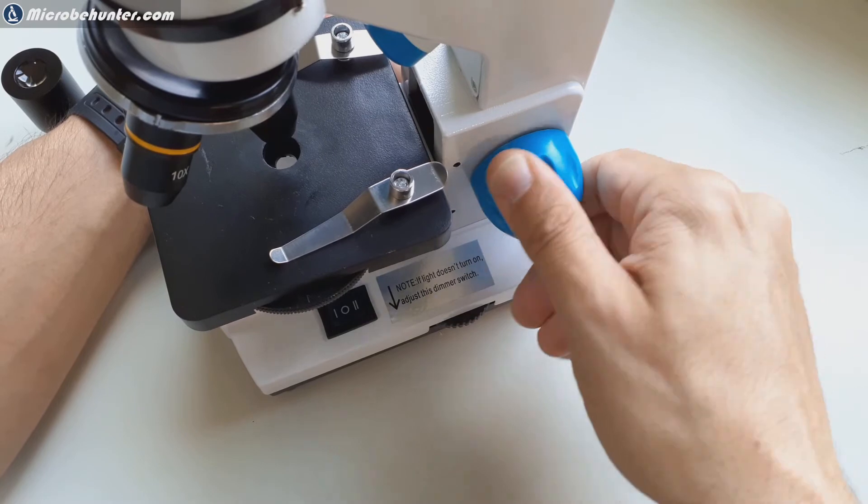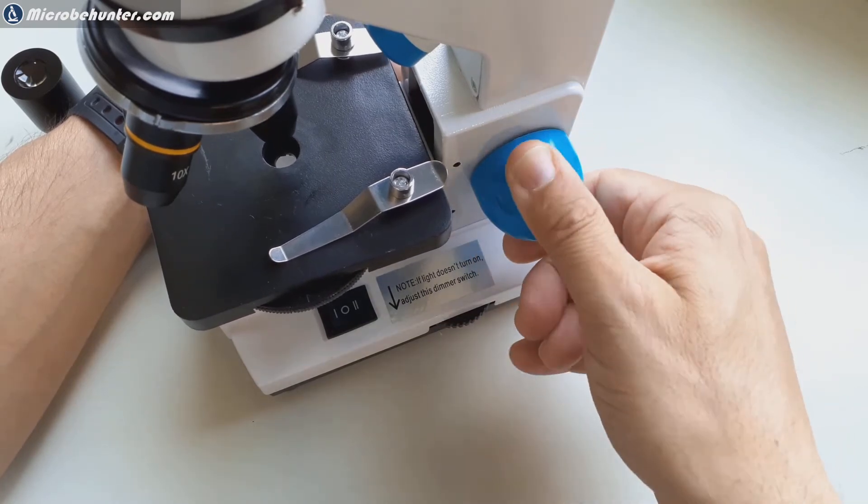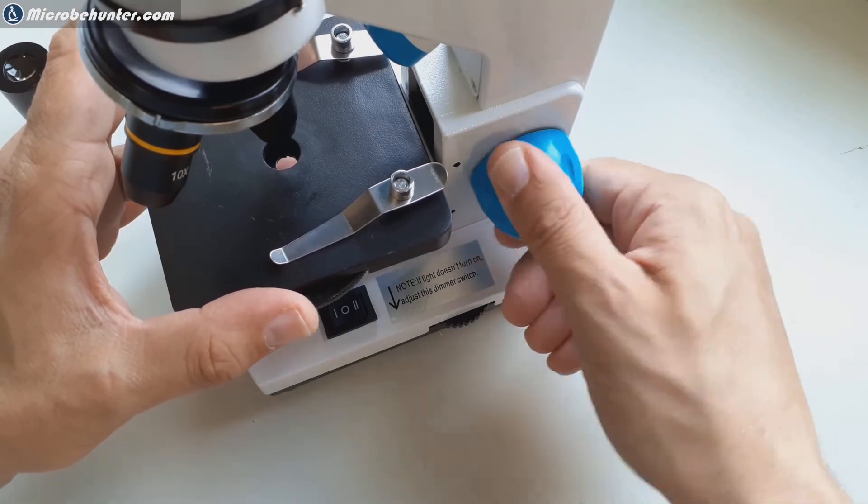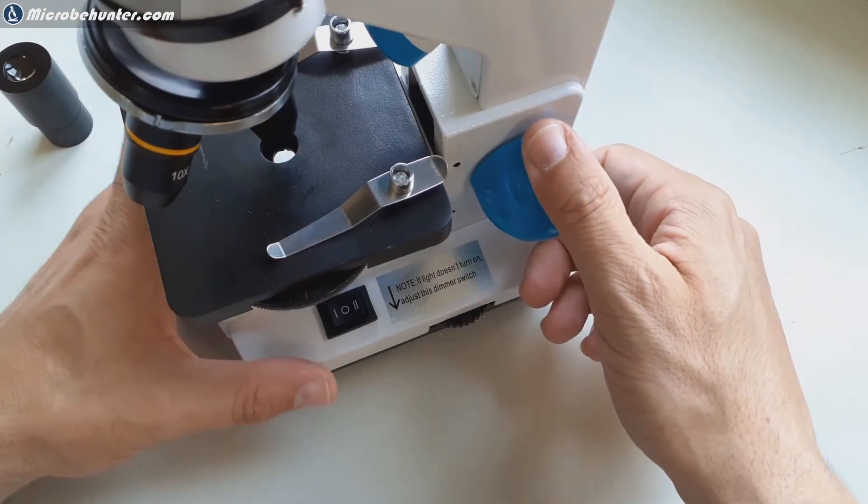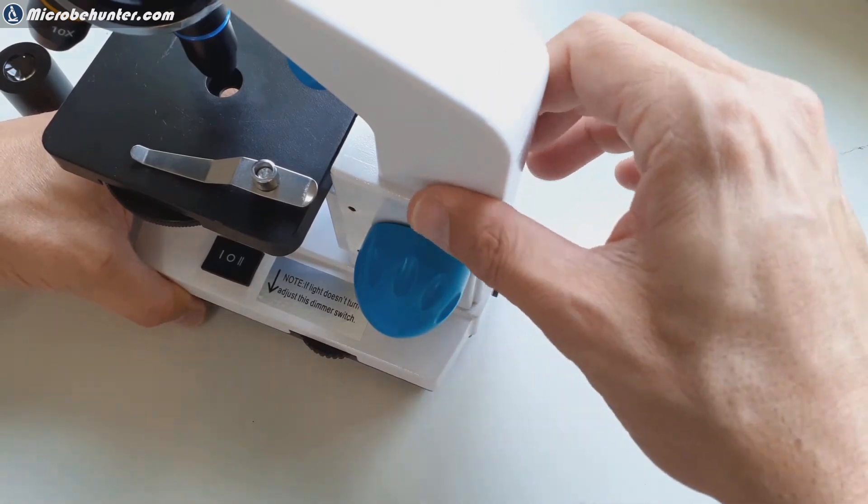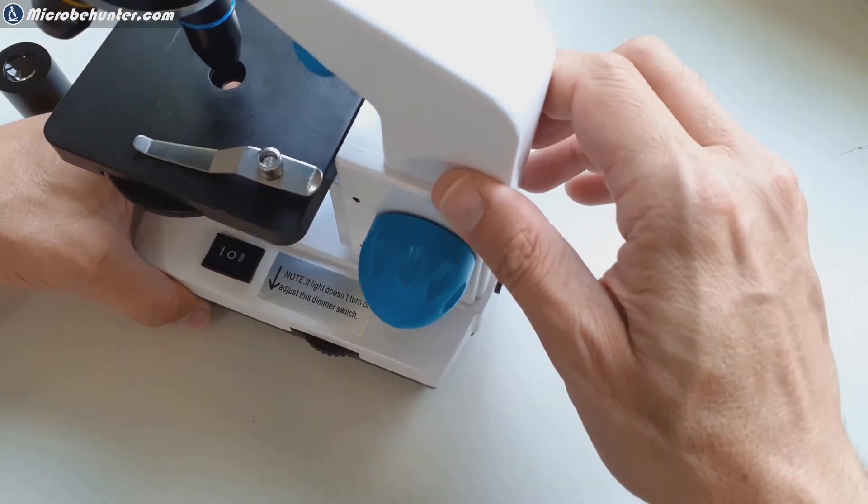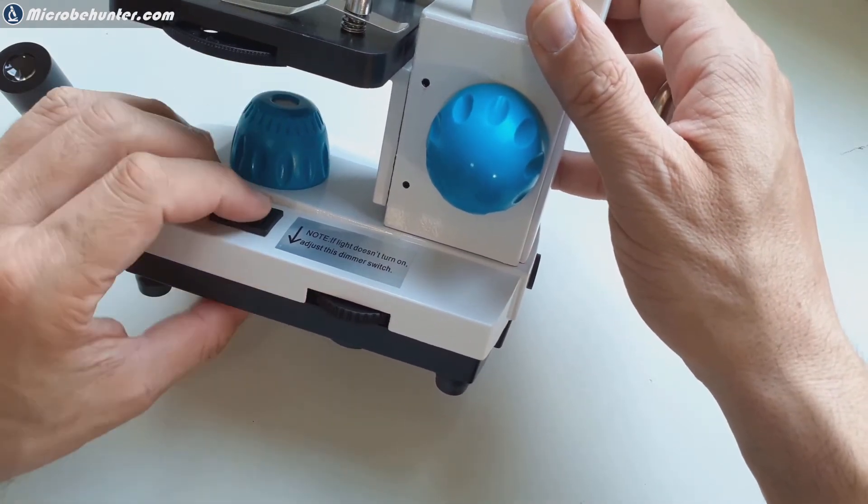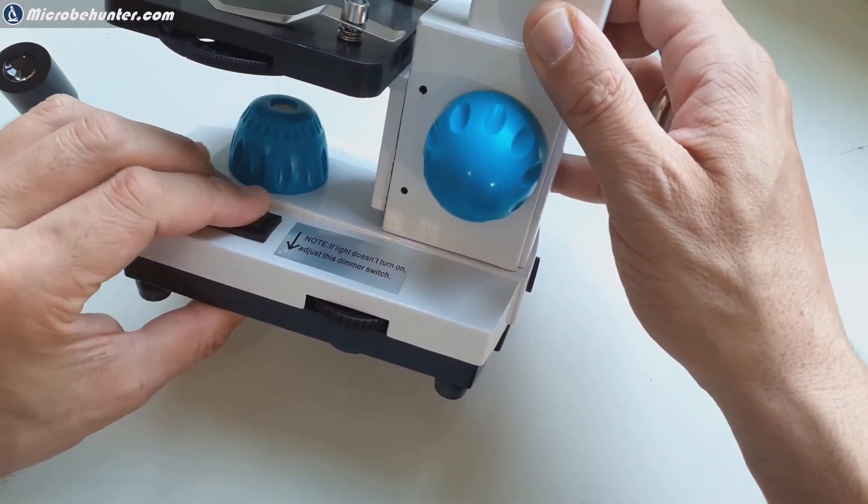Here we have the focus knob. There is only one focus knob. In many cases microscopes actually have a coarse and a fine focus knob but I think for children it's fine if there's only one, simplifies everything a little bit more. It's made of metal for solidity and stableness and for weight and mass.